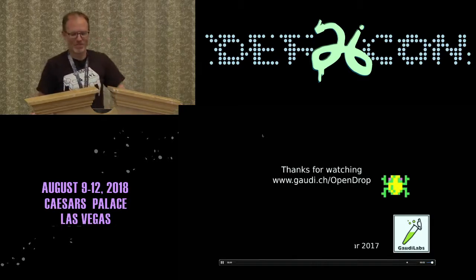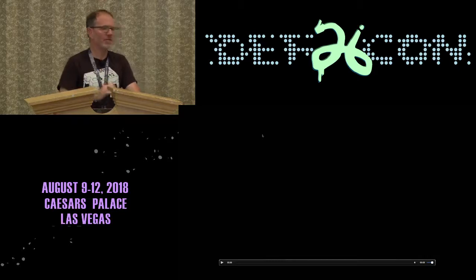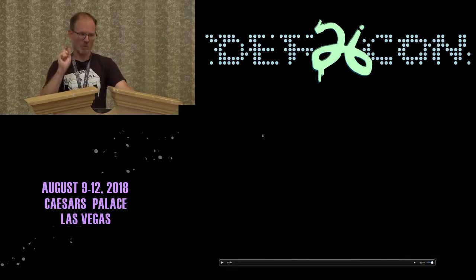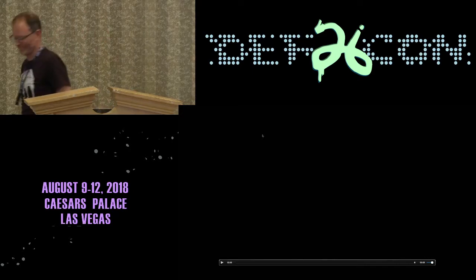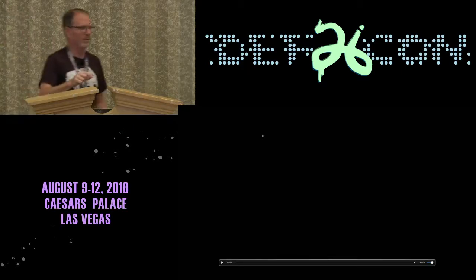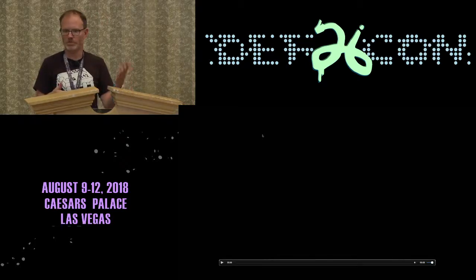Cool stuff. So one of the things that you're seeing there, he's able to program the platform. You're able to program droplet movement, and he's connected to a computer to do that.